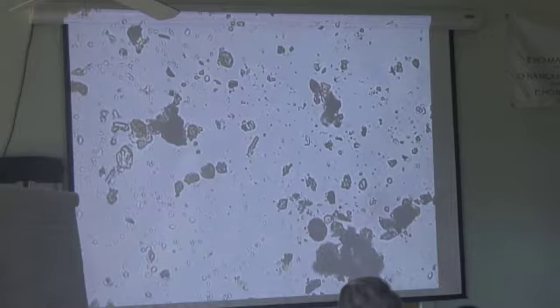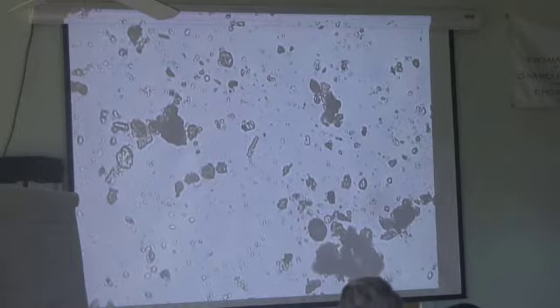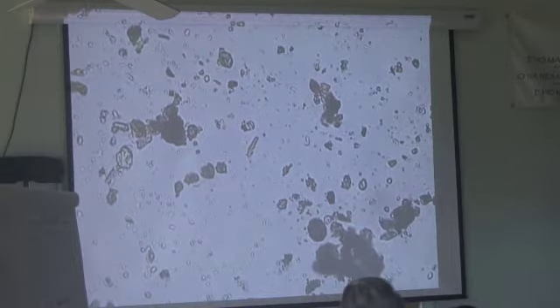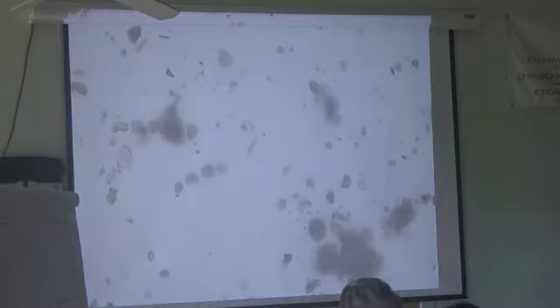So then we have our coarse focus, the big knob, and our fine focus, the smaller one here. Condenser focus. This is our condenser, and you'll notice on our condenser is our iris diaphragm. Now I've opened up my iris diaphragm all the way, and look, it's really hard to see things. Lots of things are kind of fuzzy. It's hard to resolve because we don't have good shadows.